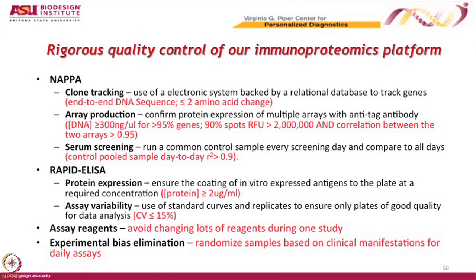routines. One of the things I will caution you about is this little subtle point down here that a lot of people forget to do, and it can really come back and bite you if you forget to do it, which is to randomize your samples when you do your assays. I can't tell you how many students I've had come to the lab and they will do all of the cases today and they do all of the controls tomorrow. And they think, all right, I did it right. It's like, no, because they will get big differences. And they say, look, I found something really cool. And it turns out the difference is because they did all of the cases on one day and all the controls on the other day.